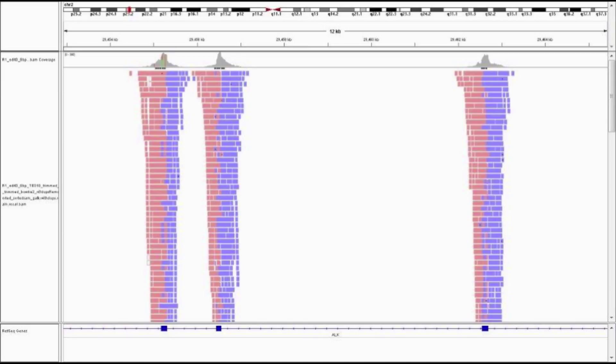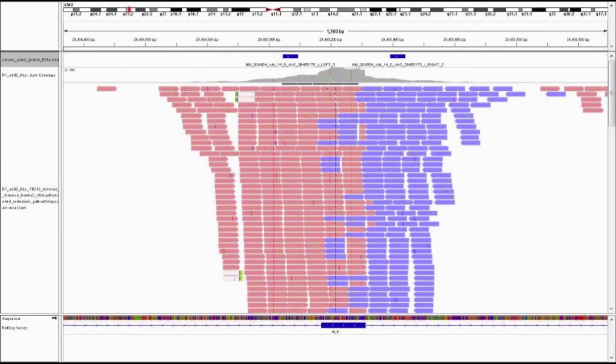Here in IGV, I'm showing three target exons of the ALK gene. You'll notice that each target has reads coming from both strands, colored in red and blue. If you zoom in to a target, you'll notice a sudden dip in the coverage representing the probe location. This is because we've trimmed these reads to remove any probe sequence. This is, however, not a complete loss of coverage since we will still have reads from the opposite strand.